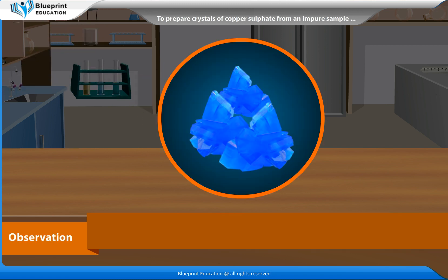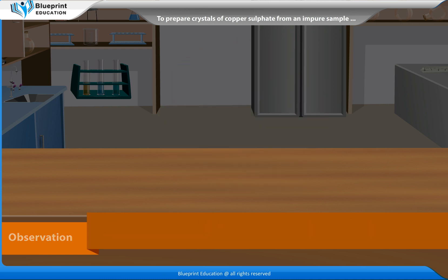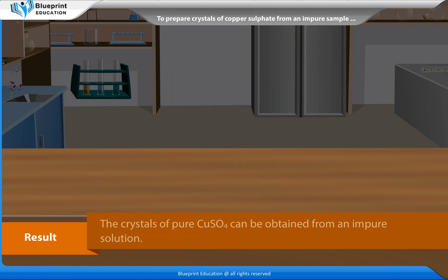Observation: Blue-colored crystals of copper sulphate are formed. Result: The crystals of pure copper sulphate can be obtained from an impure solution.